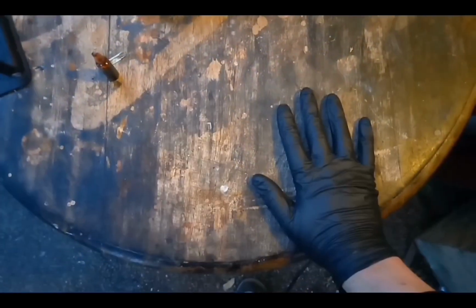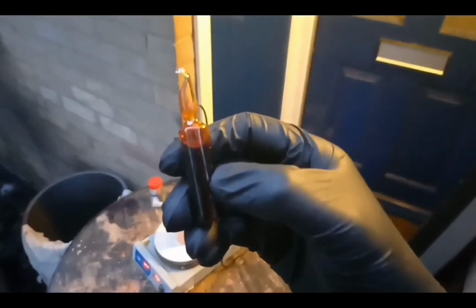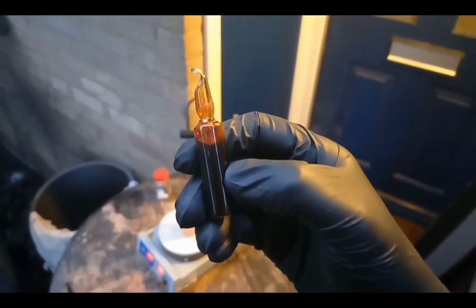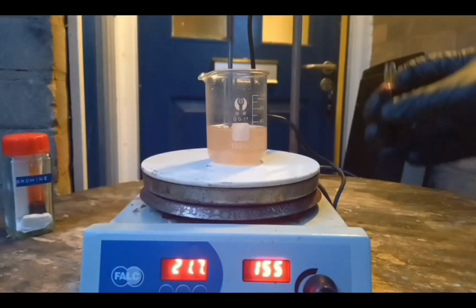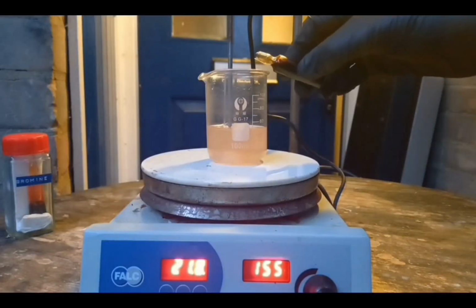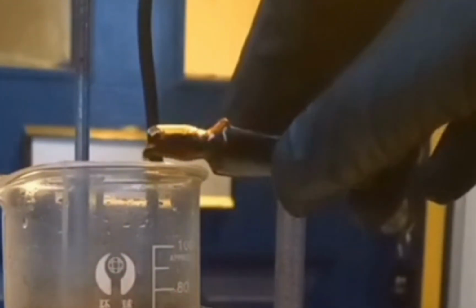Gloves are actually pretty useless when working with bromine. This needs to be safely opened. Bromine, even though it's quite a large molecule compared to air, has a high vapor pressure. It will escape almost any container. It will form a dense gas inside any container and find its way out through any small gaps.